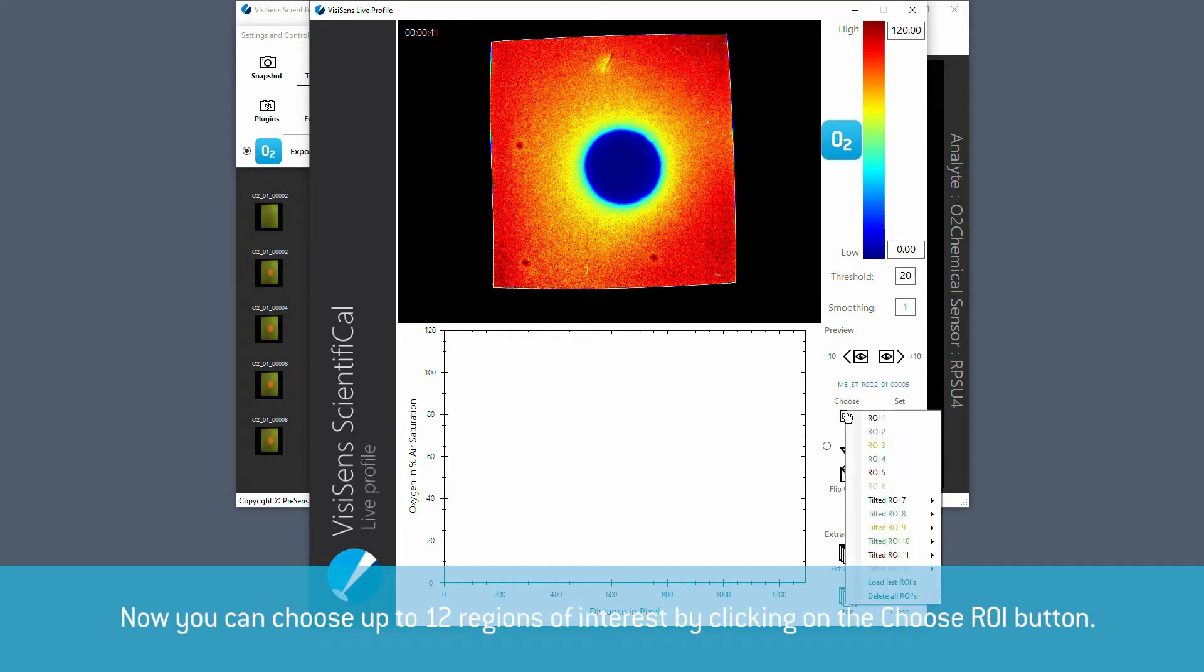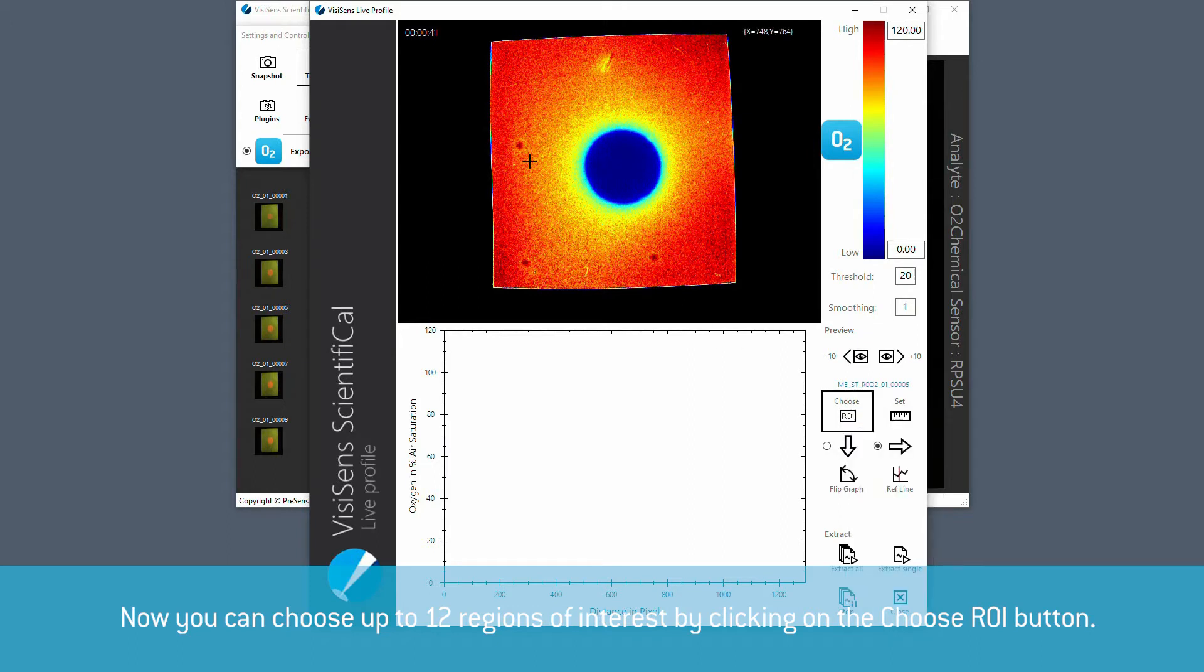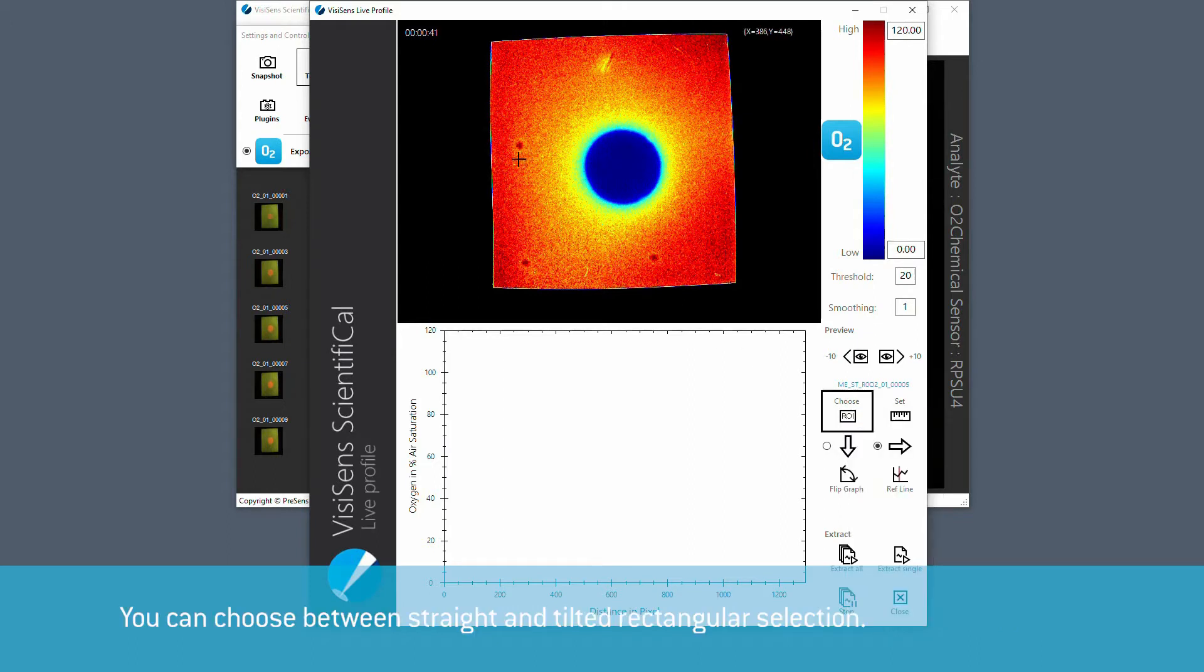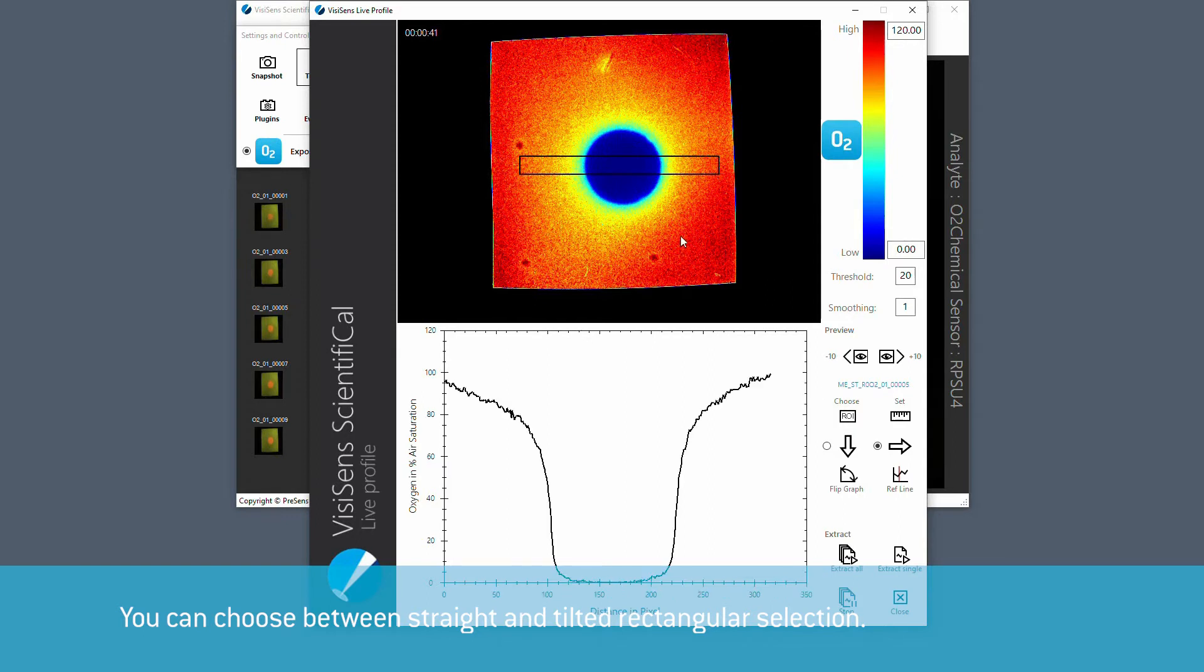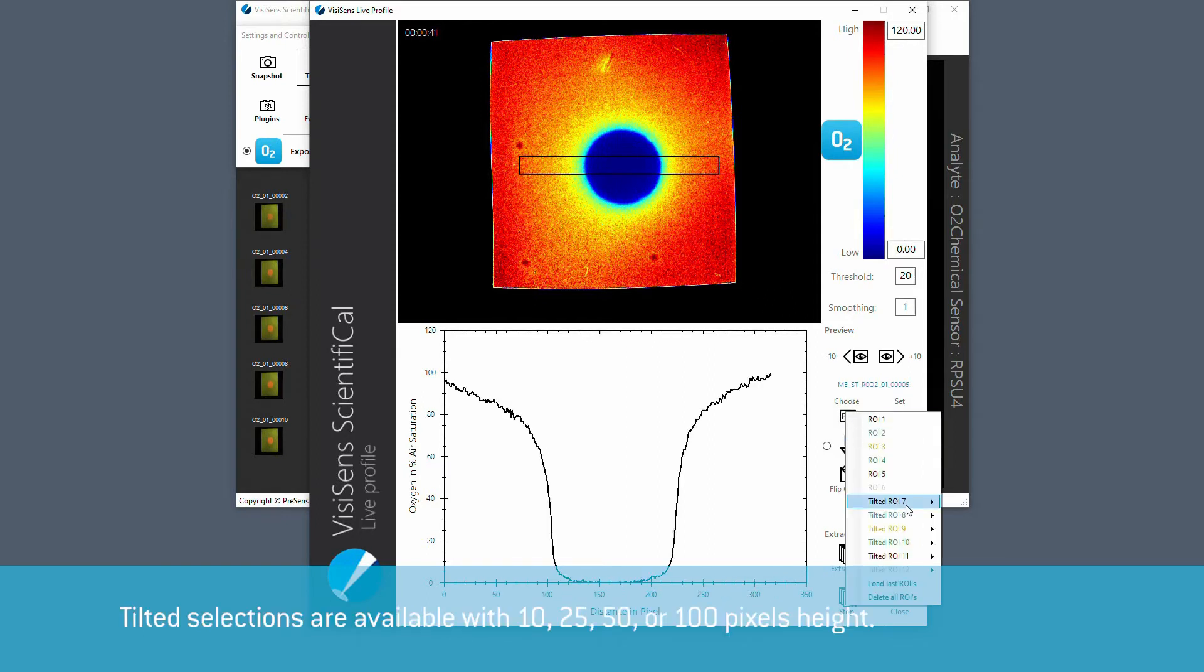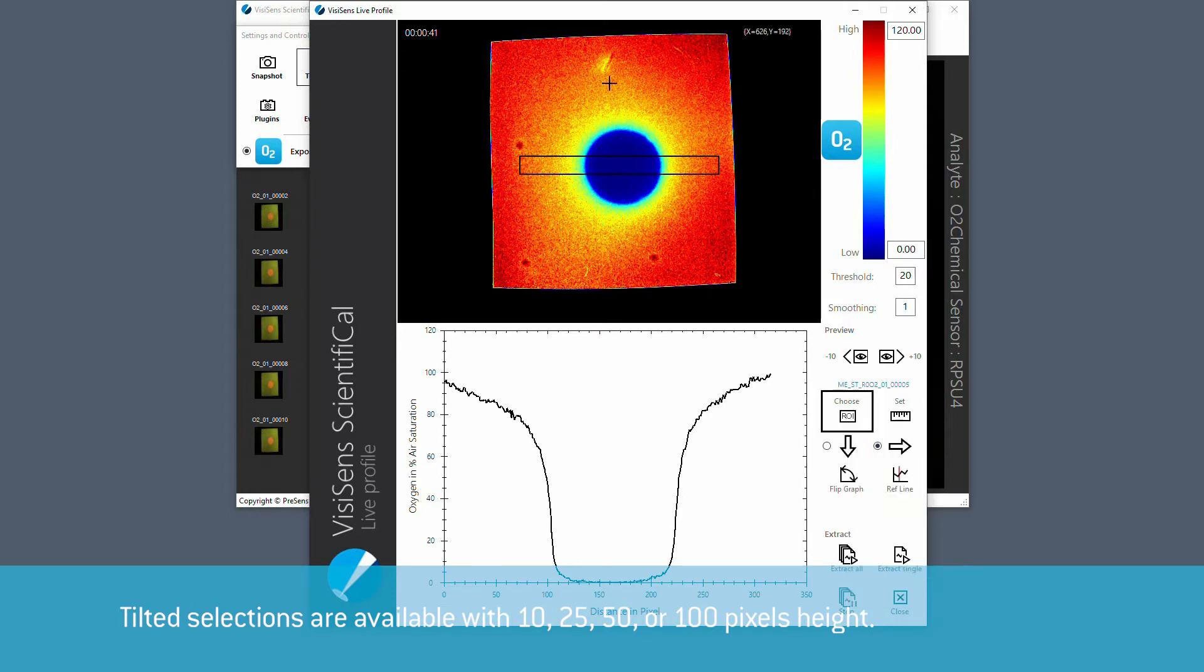Now you can choose up to 12 regions of interest by clicking on the choose ROI button. A menu strip will open that allows to choose between straight and tilted rectangular selection. Tilted selections are available with 10, 25, 50 or 100 pixels height.